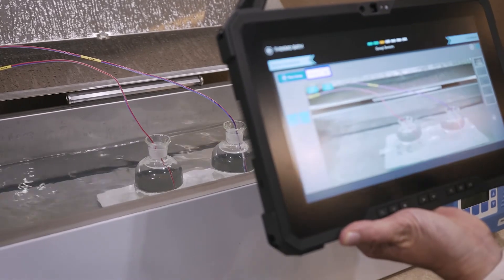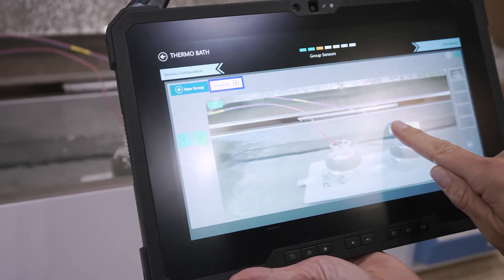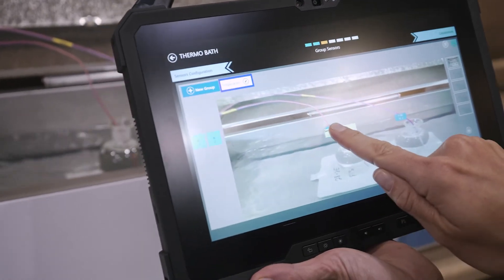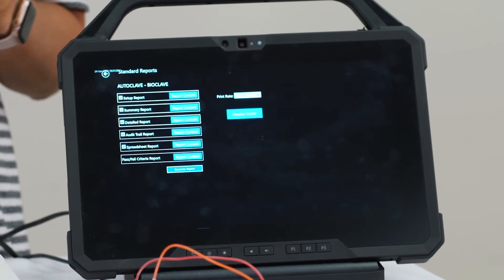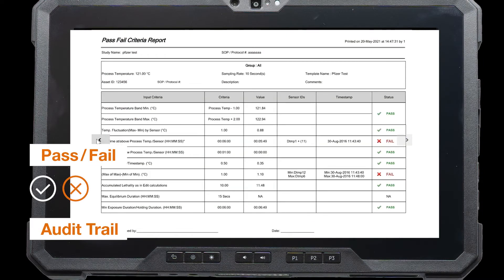You can also create a layout within the software using the back camera or front-facing camera to take a picture of your loggers and label them within the software. Within the RT valve probe software, we've also enhanced our reporting tool — we've added a pass-fail report and an audit trail report. When you go into reporting, you can easily grab all the reports at once so you don't have to print each one individually.